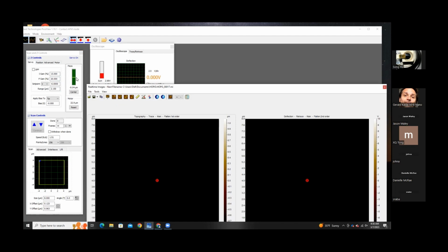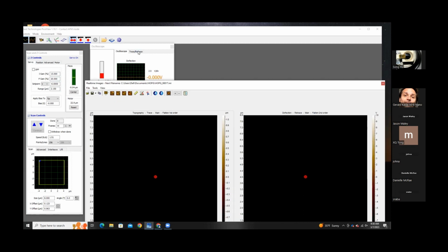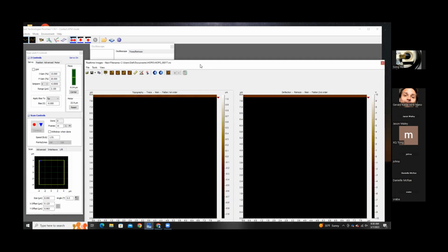If it is STM, the tip is already probably crashed. So yes, AFM is much more forgiving. And then you click this button, which shows that it's scanned down. Click that, and then your image starts. At the beginning, the image is blurry.